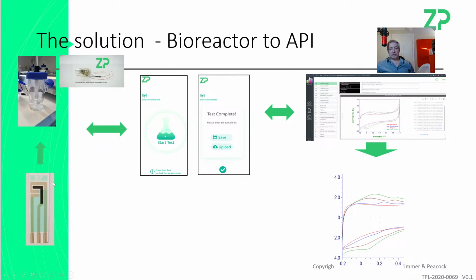So you have your glucose sensor. There is some engineering needed to put it into that cell culture environment. You need the electronics, which can come from companies like Zimmer & Peacock. If we were doing product development around this, we would be sending our data immediately to the cloud. We have something called Juli, by the way. I haven't at all mentioned Juli.